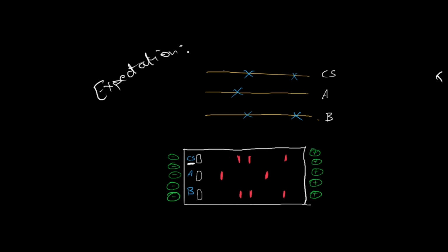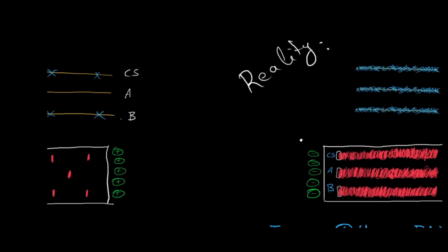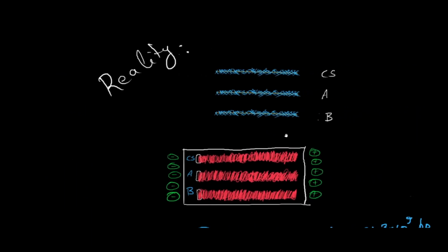So this is a sample from the crime scene, and you can see that the gel electrophoresis pattern in this hypothetical scenario matches well with B. So we would be able to say that there's a match for B and a non-match for A here.